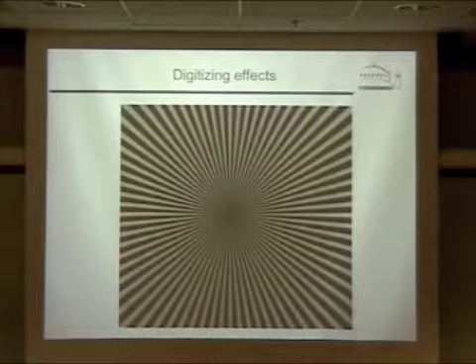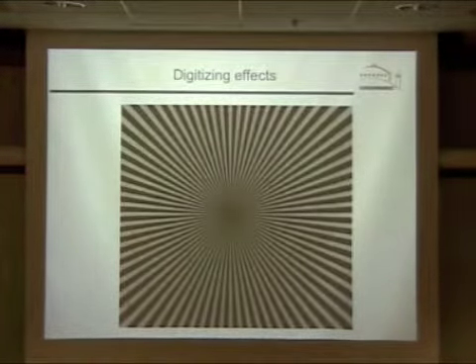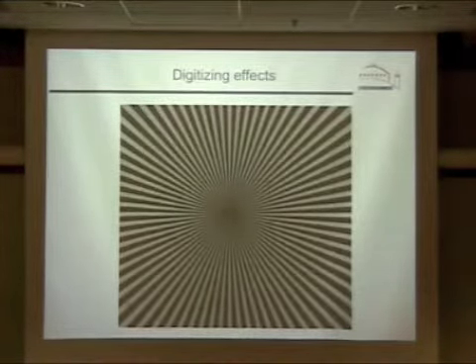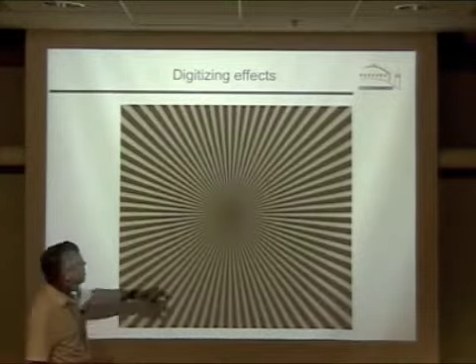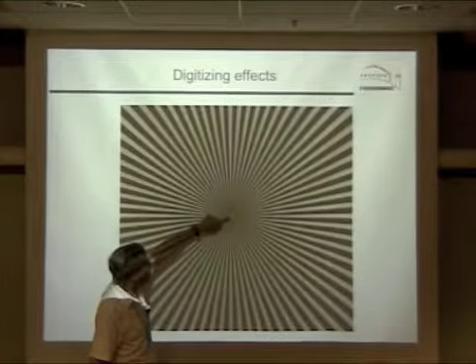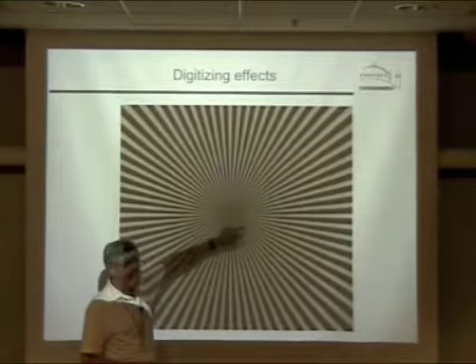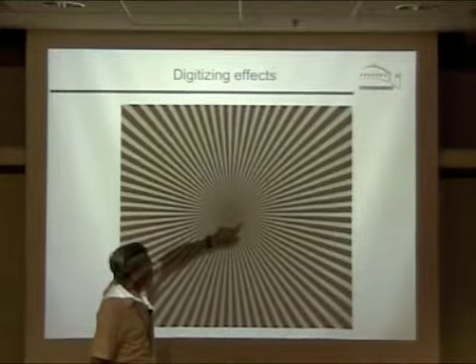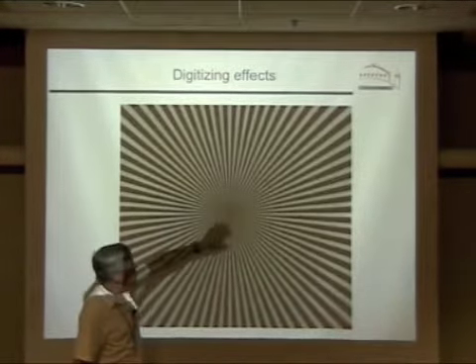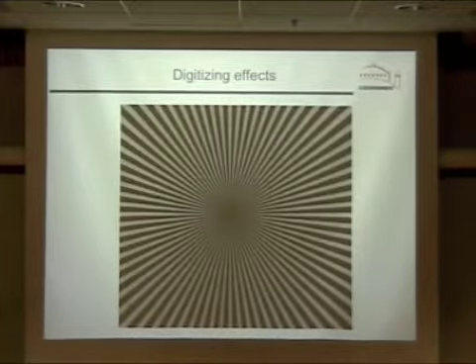This was actually digitized on maybe our Nikon scanning densitometer. It's perfect. Well, it's not, because even up here, I can see that the contrast disappears about here. And I know that the signal goes into here. But standing right here, I can see that there are funny sort of what we call aliasing effects where the image is not really well preserved in this region out here, just before the contrast really disappears. And I thought maybe that would show up a little bit better.